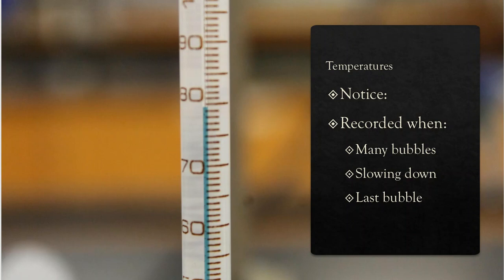So 3 temperature recordings is what we've made. One, when we got a stream of bubbles; 2, when the bubbles slowed down significantly from before; and 3, the temperature of the very last bubble. And I can use all 3 of those to maybe help me make my decision on which identity this unknown is going to be.